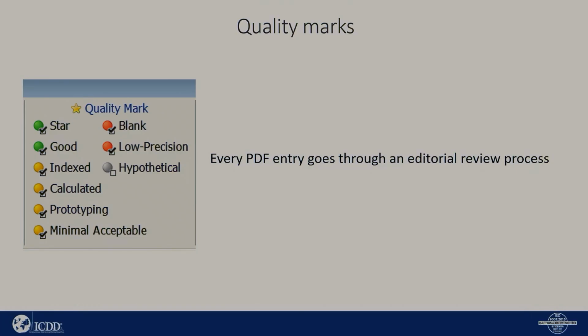Now, why would you put lowest quality in the database? Sometimes it's the only data available. Someone has published a pattern, but there's some delta 2 theta errors that we see. We'll make note of that to say, understand, here's this particular entry, but also be careful when you're comparing it to your data.